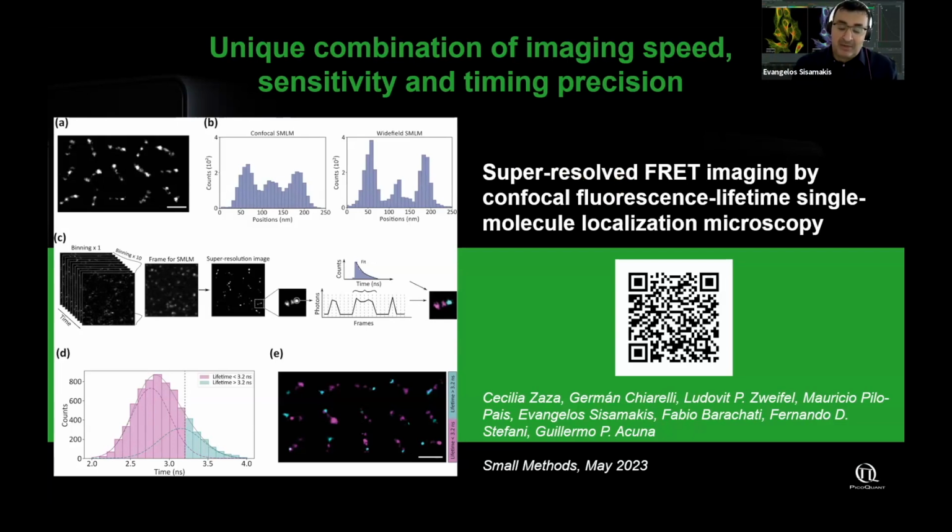And this is true, but for the case of Luminosa this can be circumvented in a way, because one can set a very long tiling and stitching measurement for single molecule localization microscopy, and then leave the room and go home. So the measurements that you have seen here are mostly overnight measurements, where you can set the microscope to measure for 12 hours, and then you don't have to worry so much about the speed.